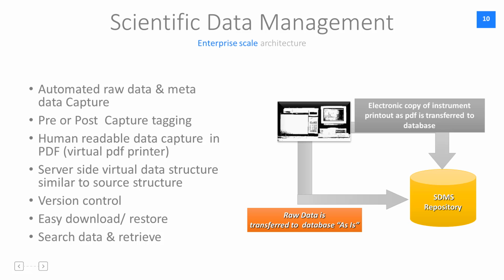On the server side, as I was mentioning about the mimicking of folder structure, the system will be able to show you the virtual data structure at the server side. The system can do version control of data. Users will be able to easily download or restore their data, as well as search data and retrieve data at any point in time.